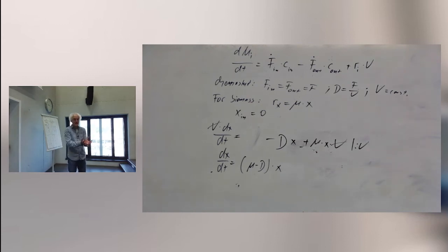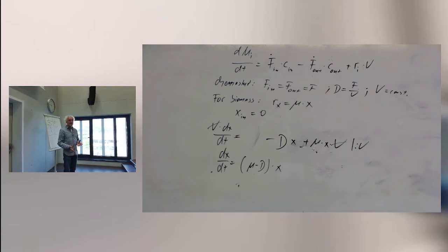You will do that experimentally in a chemostat. But how are we ensuring that it's constant? The bioreactor needs to get to a steady state. So we start it, and if we come again the next week and it has come by itself to a steady state, then it is constant. If it doesn't achieve that for whatever reason, then obviously there was a problem, and we have an empty bioreactor, for example.